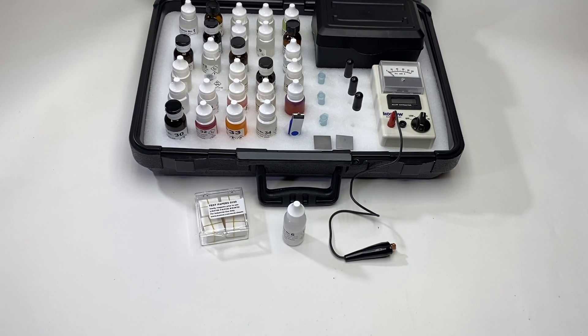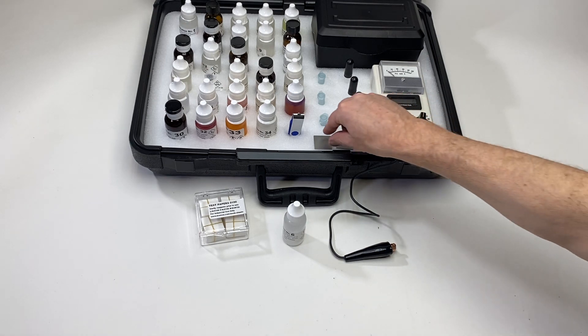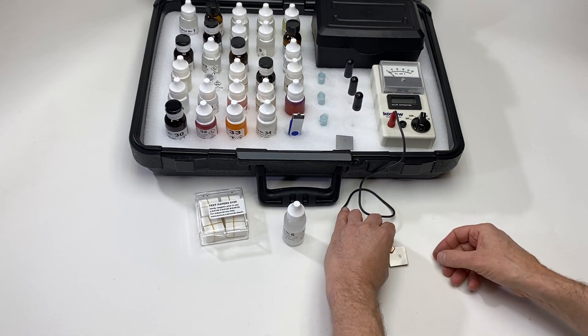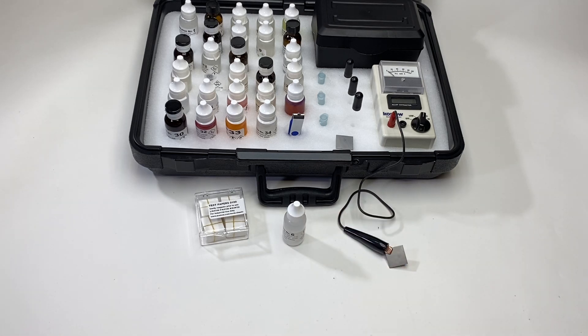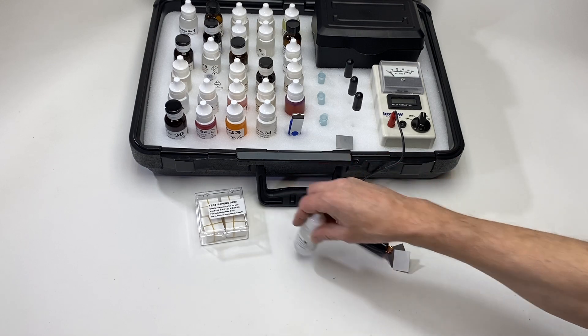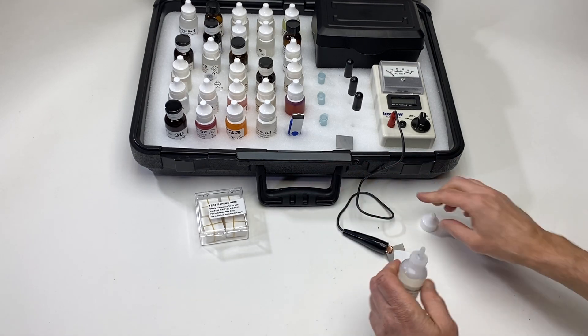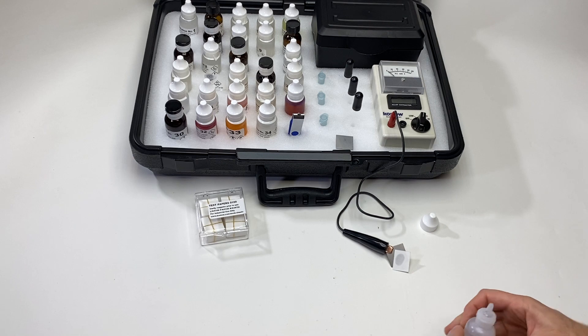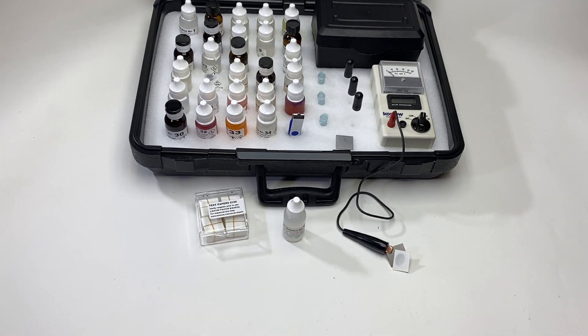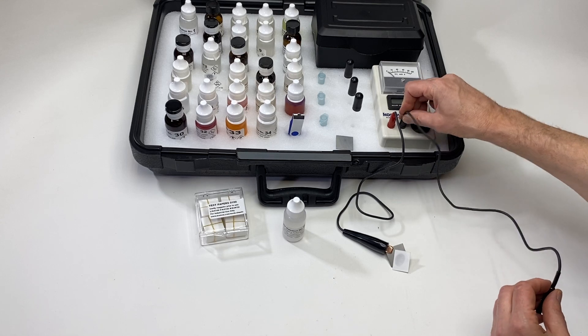Today I'm doing a demonstration of the iron test using the Detective Lab 1899. According to the manual, the first step is to attach an alligator clip and then put on an 0100 test paper. After the paper, add a drop of solution 6.